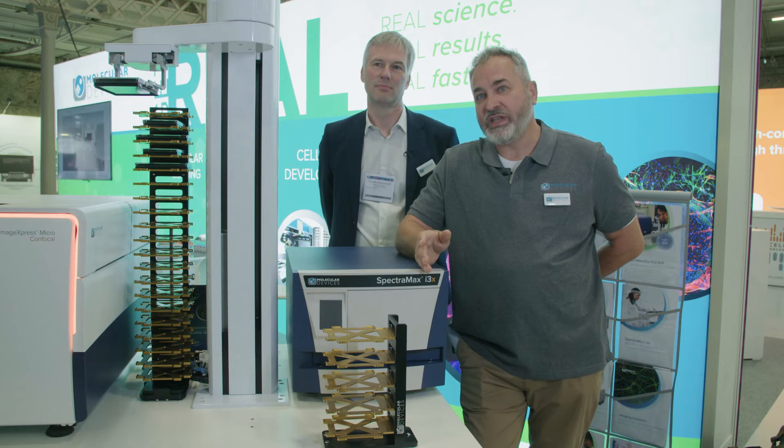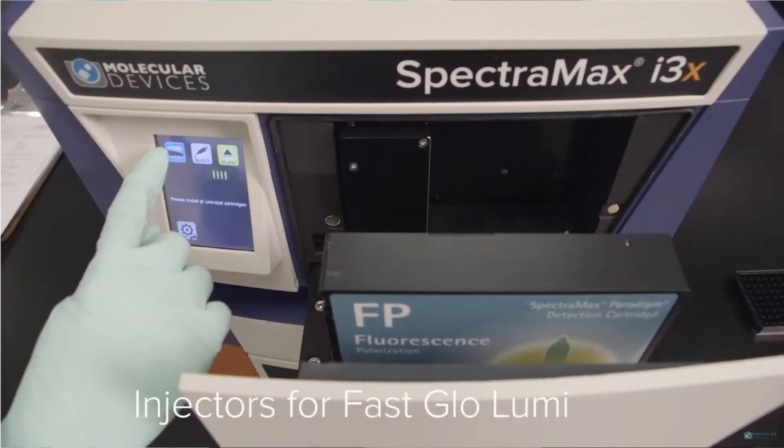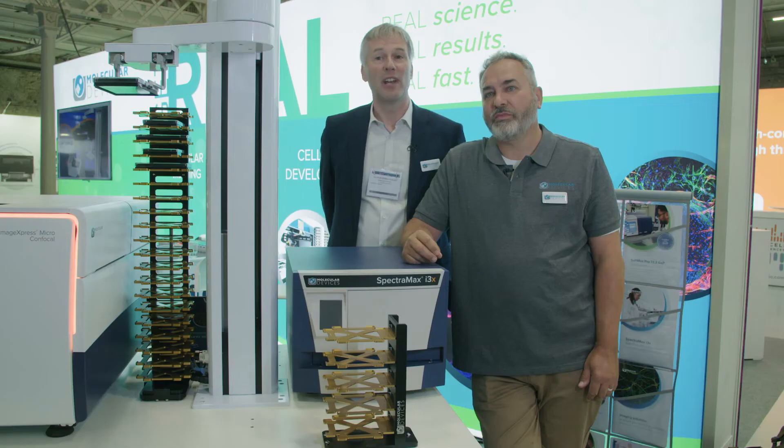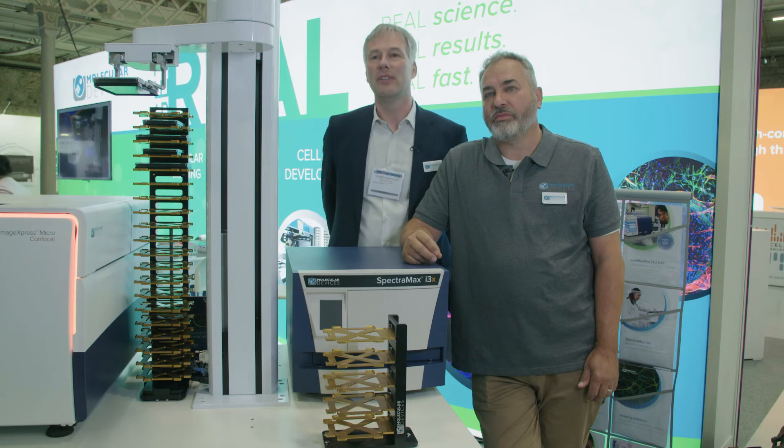Over time, as your research needs change and your budget increases, the system is expandable. Supporting laboratories working in a validated environment is our core business. For the i3X, we can provide help on writing the URS, on the iQOQ, on the installation, on the after-sales service and the regular requalification of the instrument.